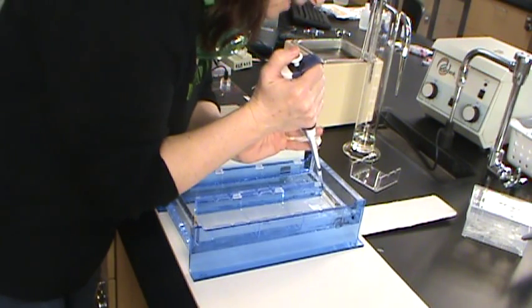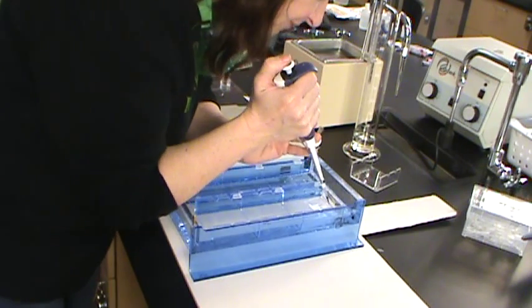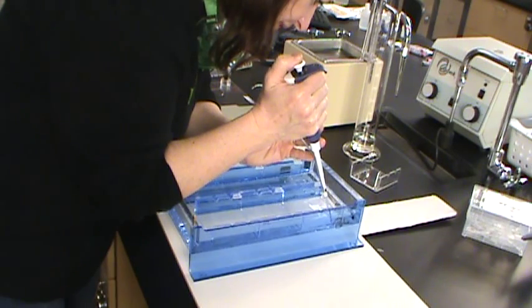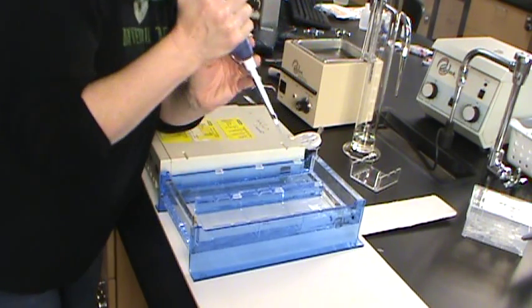Now, these are hard to see. Sometimes students have trouble seeing these, and what I would suggest is that you check to see whether you like this under a white sheet of paper or on the black surface.